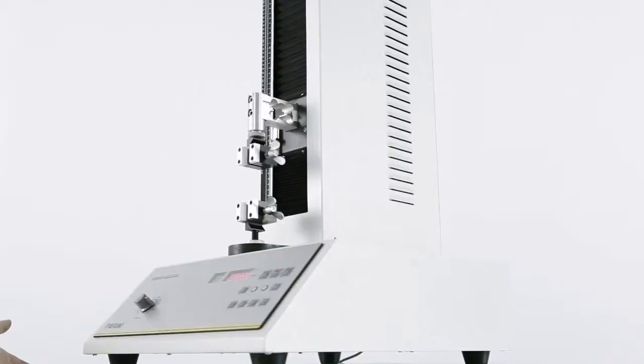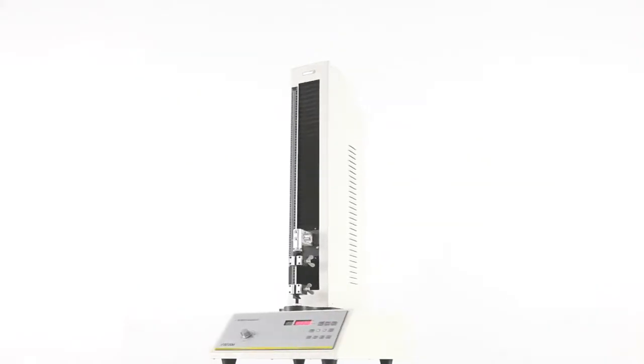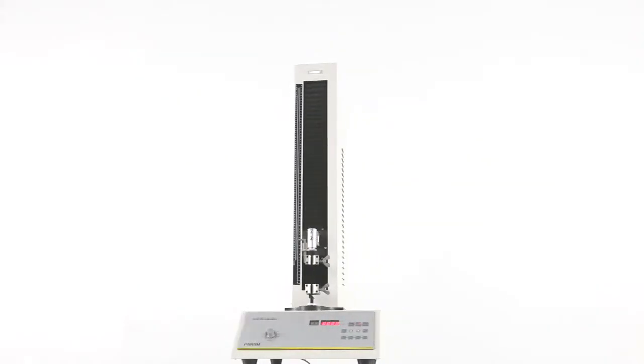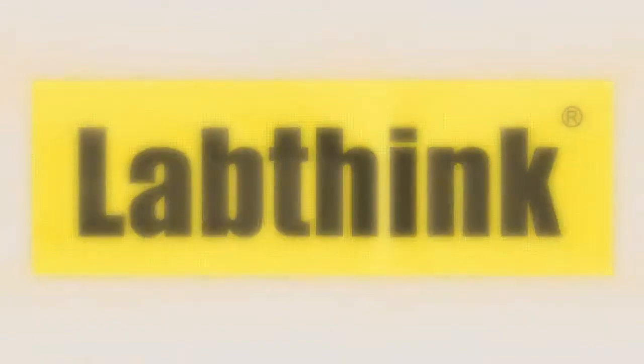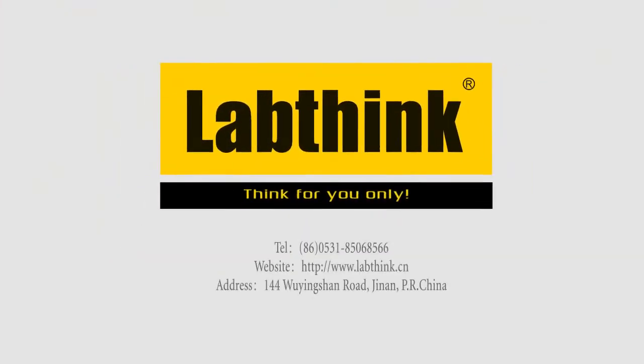XLWB, your excellent choice for an economic tensile tester. LabThink, think for you only.